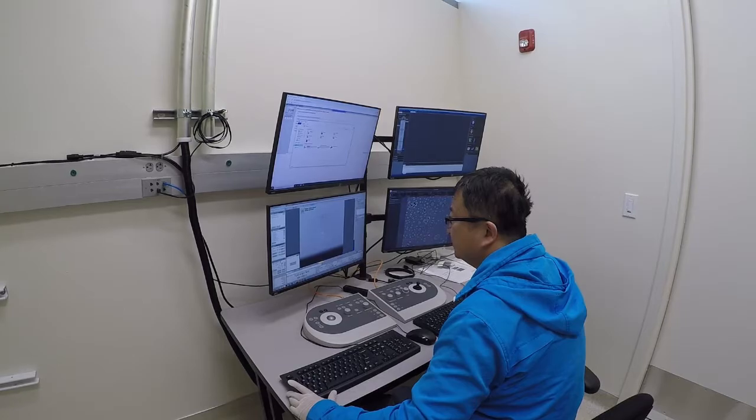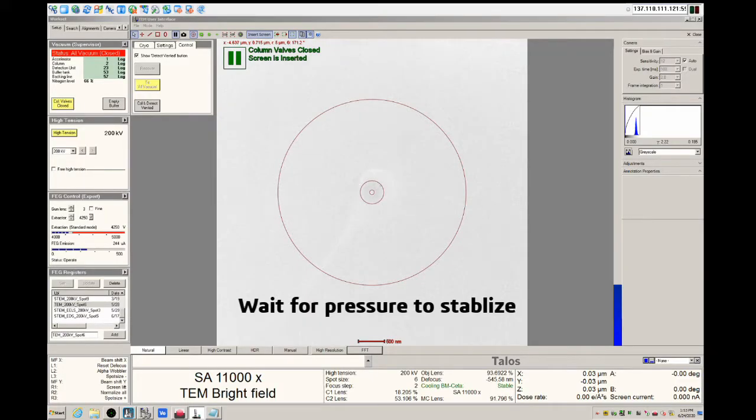The rest of this video will detail some of the basic alignments that you will be expected to perform. Once the column shows a pressure of less than 15 log, you may open the column valve to irradiate your sample with the beam.